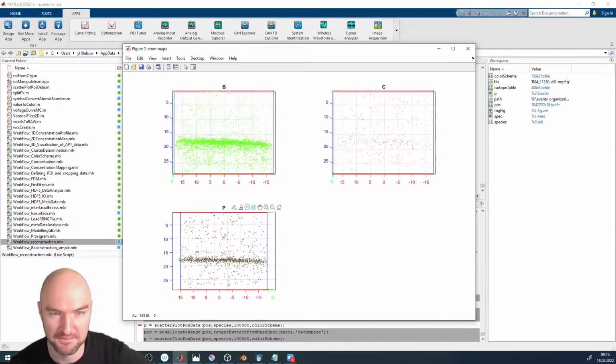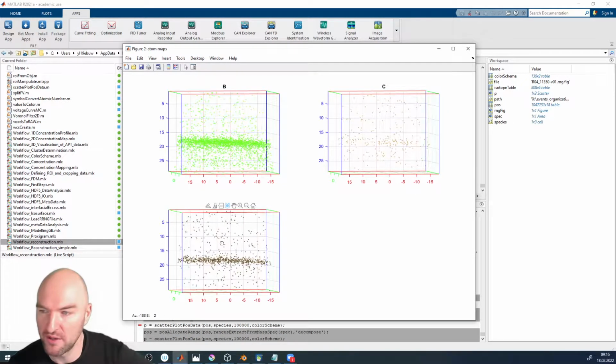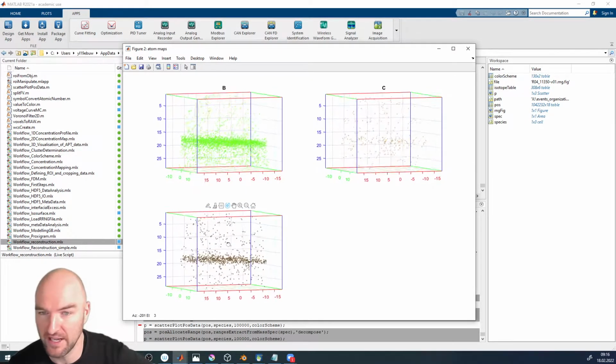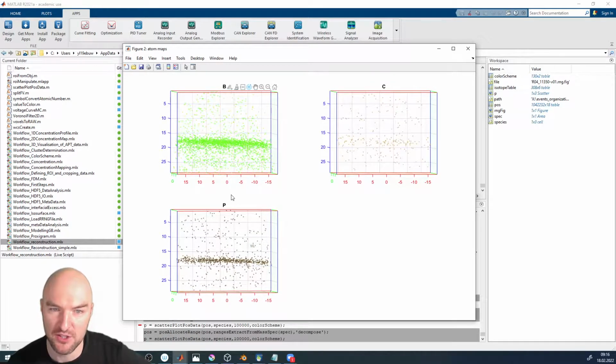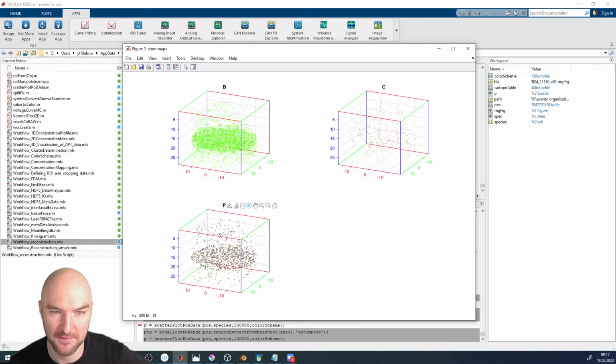It would do the job. But very often you're going to move to interfaces where this is no longer possible. We're starting out with something very simple, and we're going to jump into modeling. So the question is now, how do we get our atom probe data into Blender?